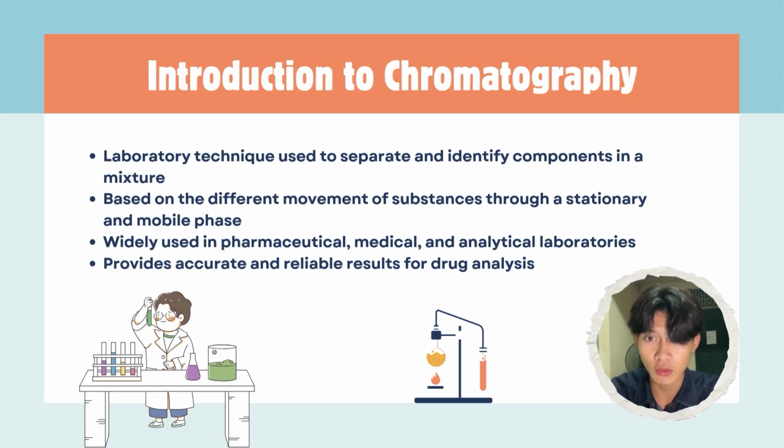Chromatography is widely used in pharmaceutical, medical, and analytical laboratories. It is especially important in drug analysis because it provides accurate and reliable results, helping scientists identify substances and determine their purity. In the next slide, we will look at why chromatography is important in drug analysis.